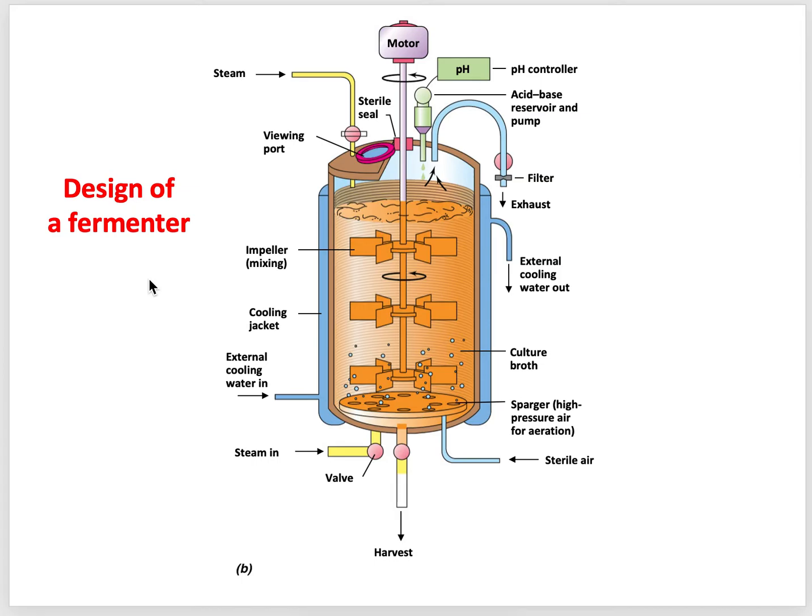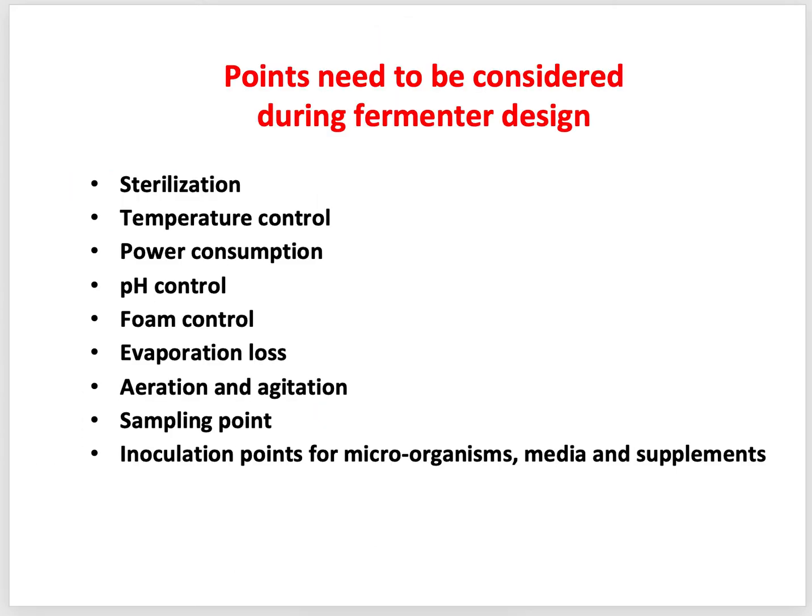Okay, so that means when we transfer our culture organisms from the pilot fermenter to the main fermenter, if the geometry is similar, the environment will be similar. So the cultures from the pilot fermenter will not feel any variations there. Okay, so that means they will require less time to adapt. It will speed up the fermentation process, definitely. Okay, we don't have to lose any time.